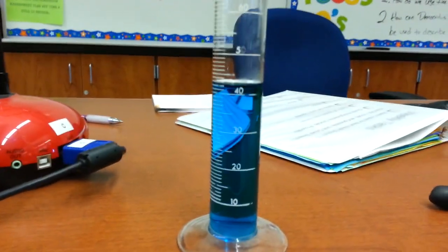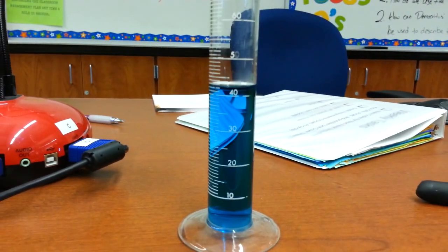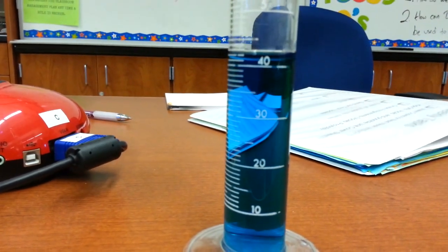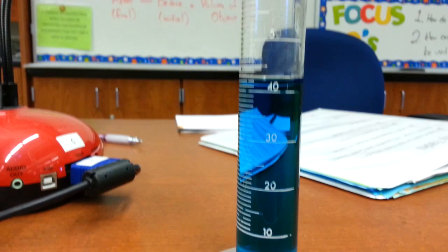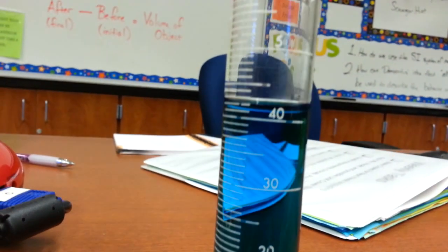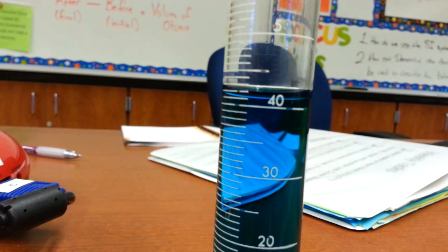So the first step when finding the volume of an object using displacement is to first read the initial volume that is in the graduated cylinder. And we do this by using these marks on there called gradations—again, why it's called a graduated cylinder—on the side.